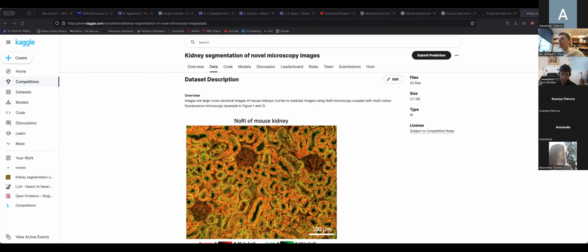So what we're looking to get out of this is a parsed image. So each pixel has an attribute. Is this given pixel part of a nucleus or not, or cytoplasm or cellular membrane, or maybe a necrotic tissue or a void, right? And so each pixel has multiple attributes. I am in the nucleus, which is in the cell, which is in the glomerulus. Does that make sense? Did I answer the question of what we're trying to get out of the parsing?